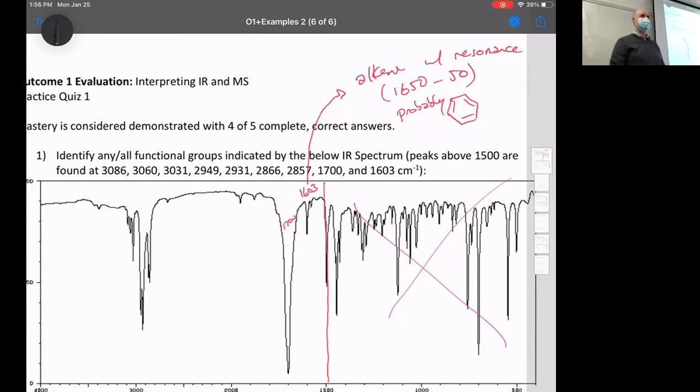Do you have that in this spectrum right here? No. So it's not a carboxylic acid. It's a little process of elimination. If you had an aldehyde, then you had that 1710 plus the aldehyde H, which showed up as those twin peaks around 2700 and 2800. By looking at this it's hard to tell, but I gave you numbers. Do you have any numbers around 2720? Don't think too hard. No, there's not. So that means it's not an aldehyde.